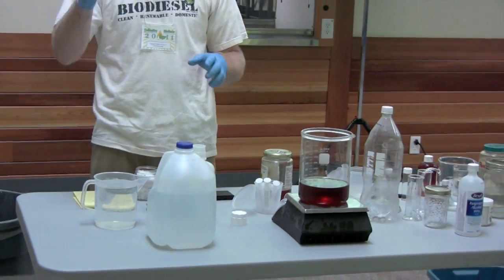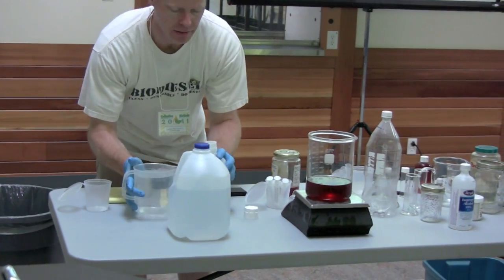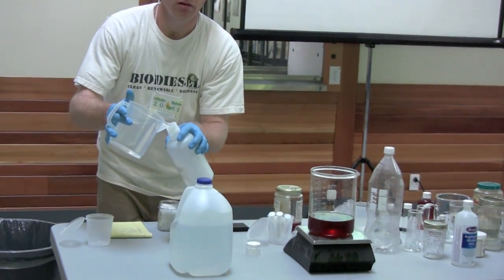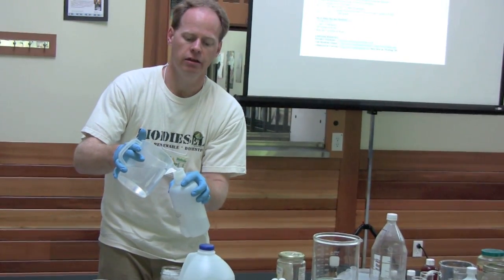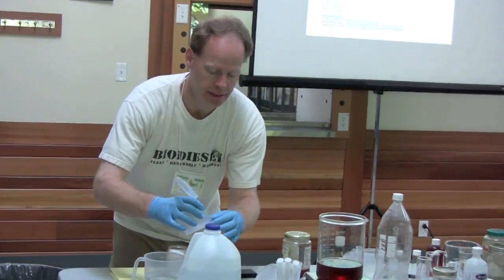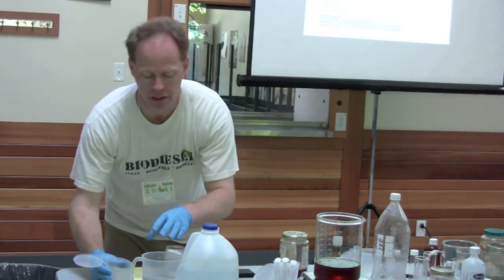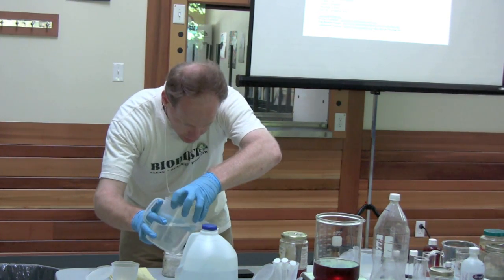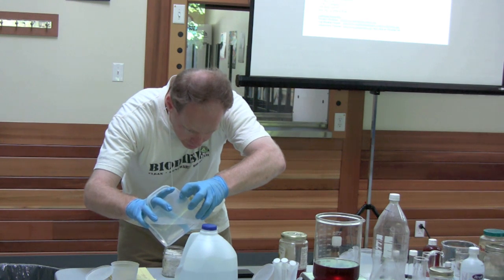So there's 1 gram. I'm gonna actually pour this in my bottle halfway. So I'm gonna put half of this liter of water into the bottle. Then I'm gonna mix my catalyst in. Then I'm gonna put the rest. The reason for that is obvious, it just helps it mix better. And it's also easier than trying to dump catalyst in a very, very full bottle.